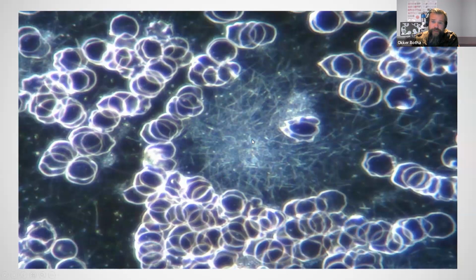What we're really concerned with here, especially with dark field, would be all the faint structures in between. So all these white lines and blotches in the plasma between the blood cells, that's often where the interesting things are in the blood, and often the things that we need to be able to identify to properly work with clients with live blood analysis.